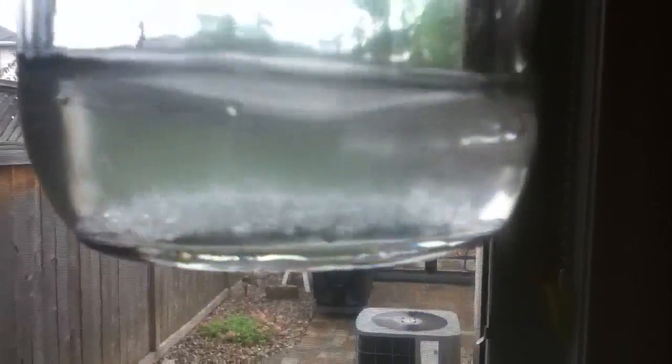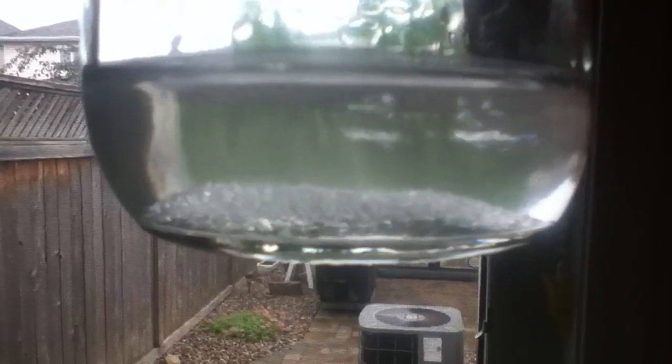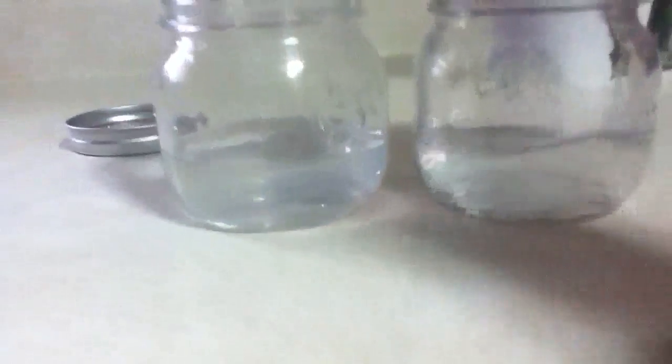In this other jar I have a solution with the same ratio, but not sodium carbonate. Now if you look, you can see nice schlieren patterns — that's when two liquids of slightly different density mix together, and you can see almost like heat patterns forming. Now that that's mixed up, take note that both of these are clear.